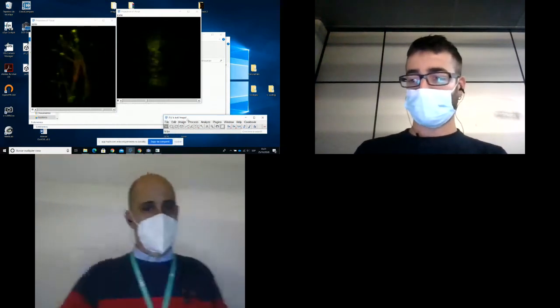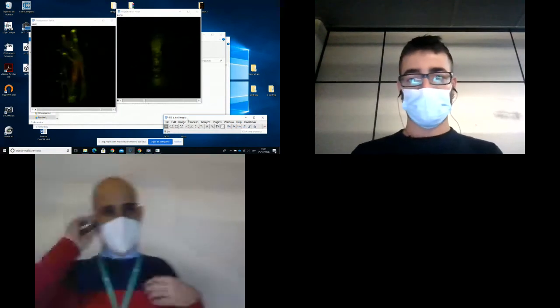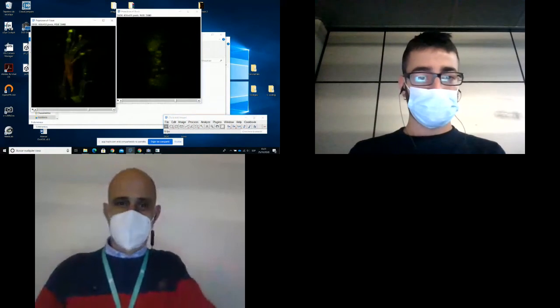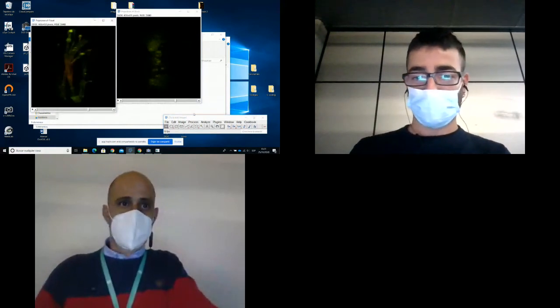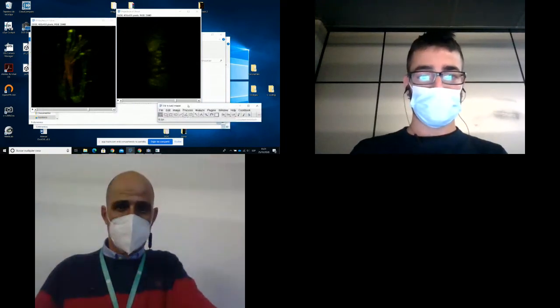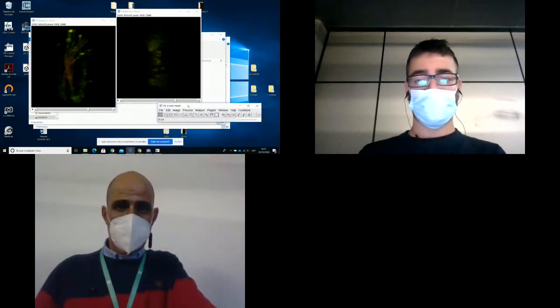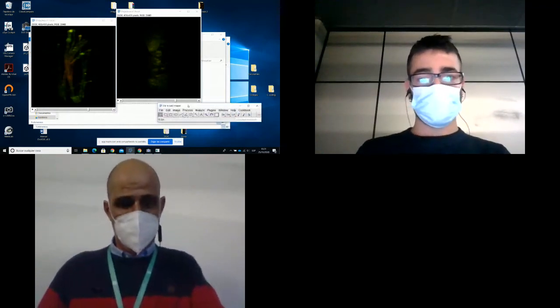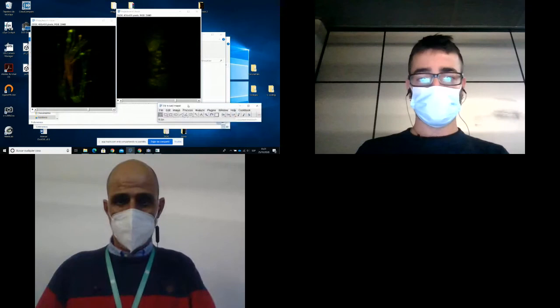the device is capable to work with any illumination, so we can work with bright field too, and you can see some images from bright field. For example, we reconstructed a chip from a condenser of a chip, sorry.